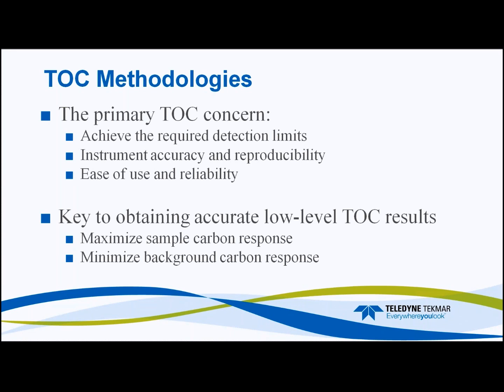The other thing that all of us laboratories are facing these days is consolidations. And sometimes it's not always chemists or application chemists that we have that are able to run these units. In some cases, we might have microbiology departments merging with the organic carbon analysis department and the TOC department.